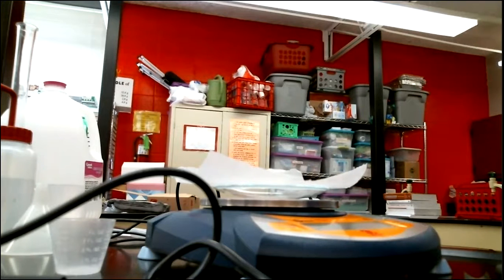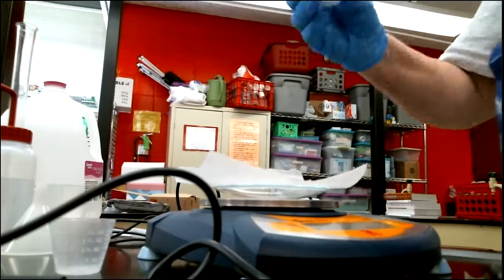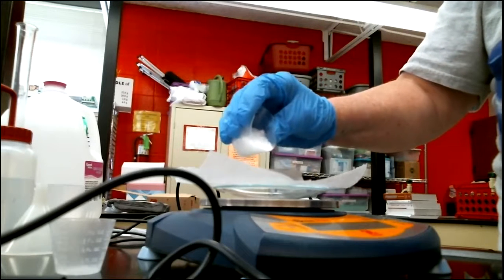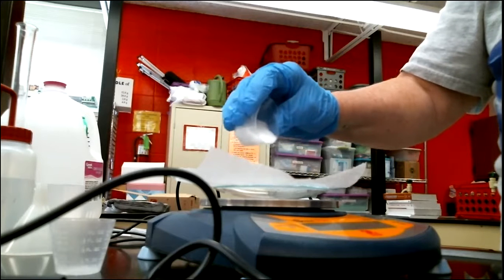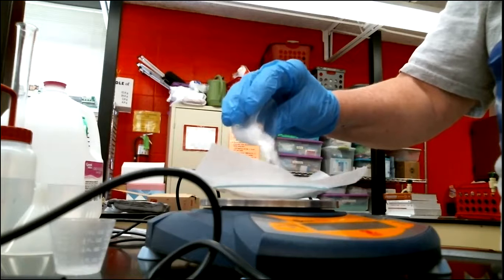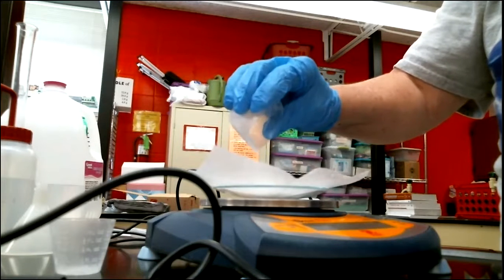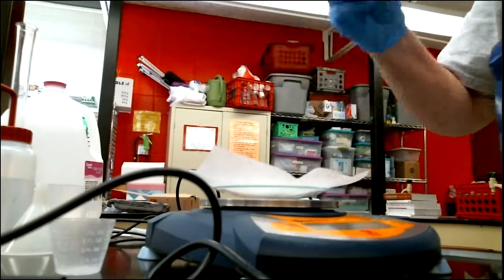All right, so I'm going to take some of my salt, and I've got a little scoop here that I'm using. It's easier than the spatula. And then I'm going to start adding it to the balance till I get my 60.18. It's going to be more than you think. It is a lot of salt. So that gave me about 17.